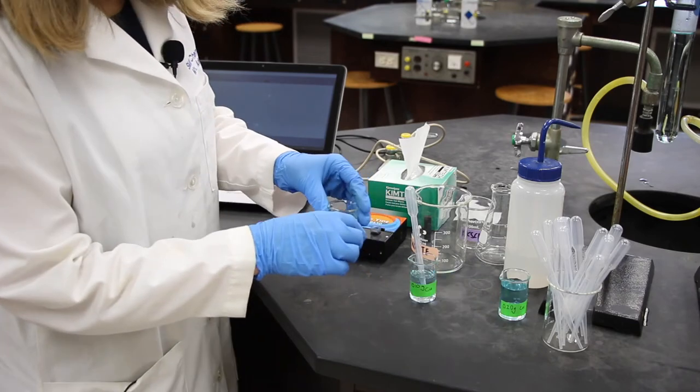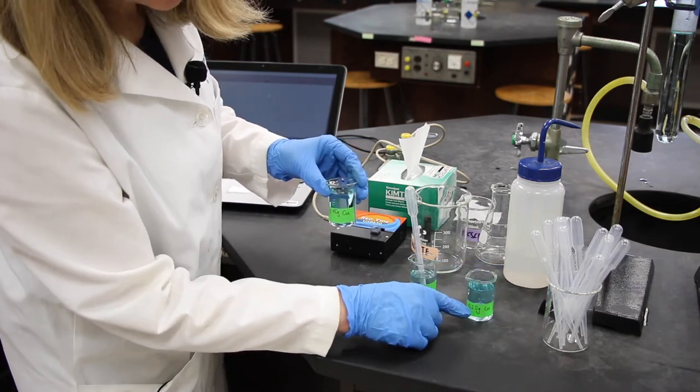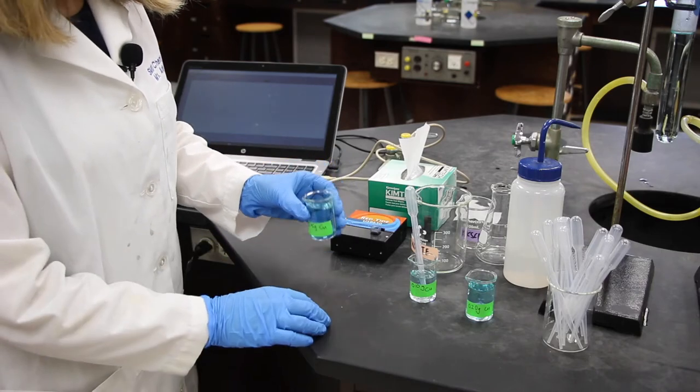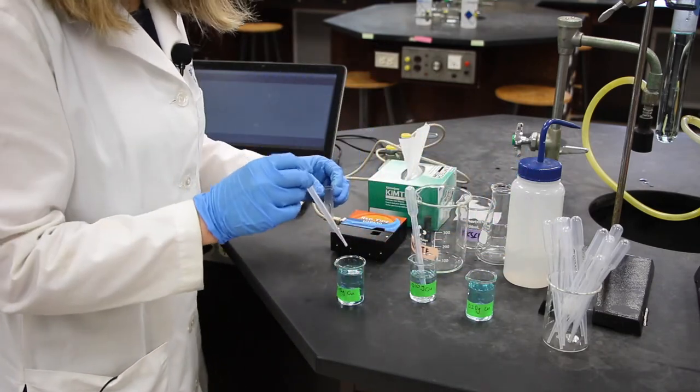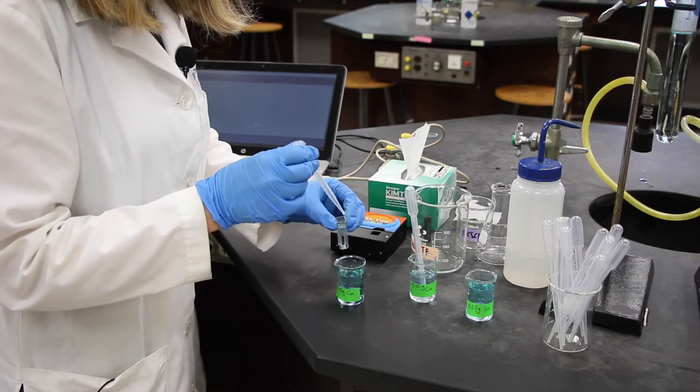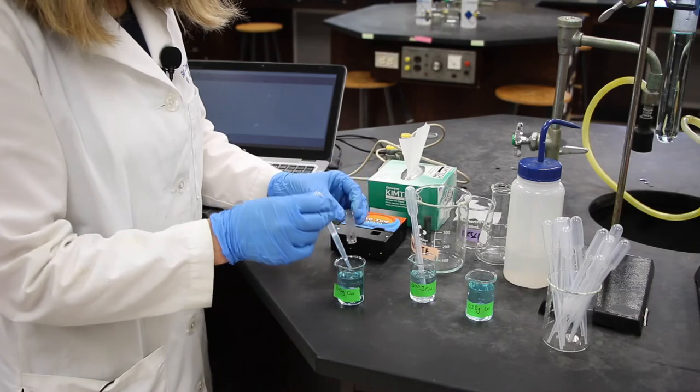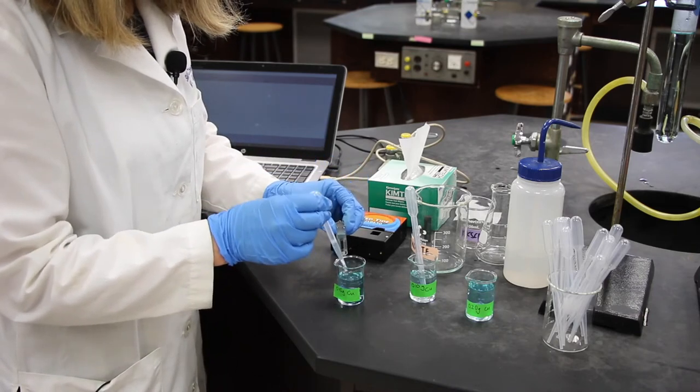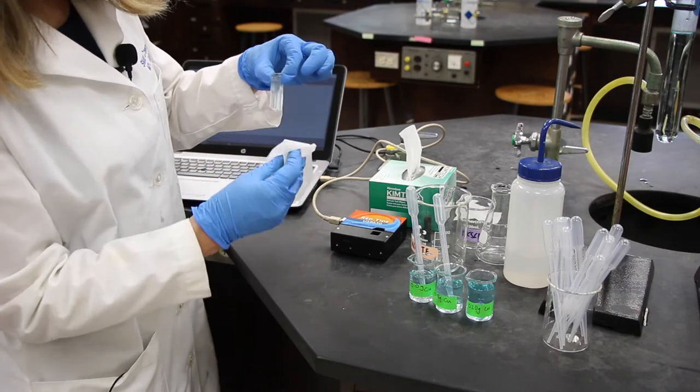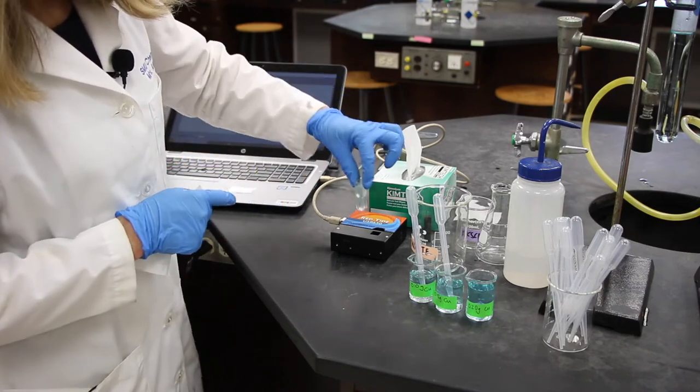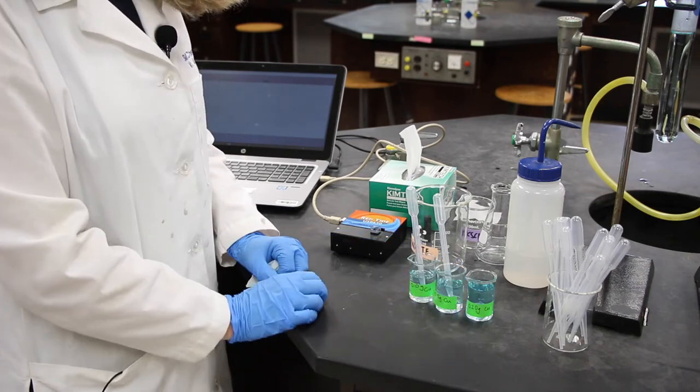Now we'll repeat this for the remaining two solutions. 0.15 grams of copper per 50 milliliters of solution. And 0.20 grams of copper per 50 milliliters of solution. We'll get rid of what was in there previously. Get a new pipette. Because you don't want to use the one that was used for the last solution. Fill it up to normalize it. And fill it up again. Again, take the Kim wipe. Wipe everything off. Hold by the top. The little diamond in the front goes toward the light source. And let's read this reading. And we'll also do the next one.